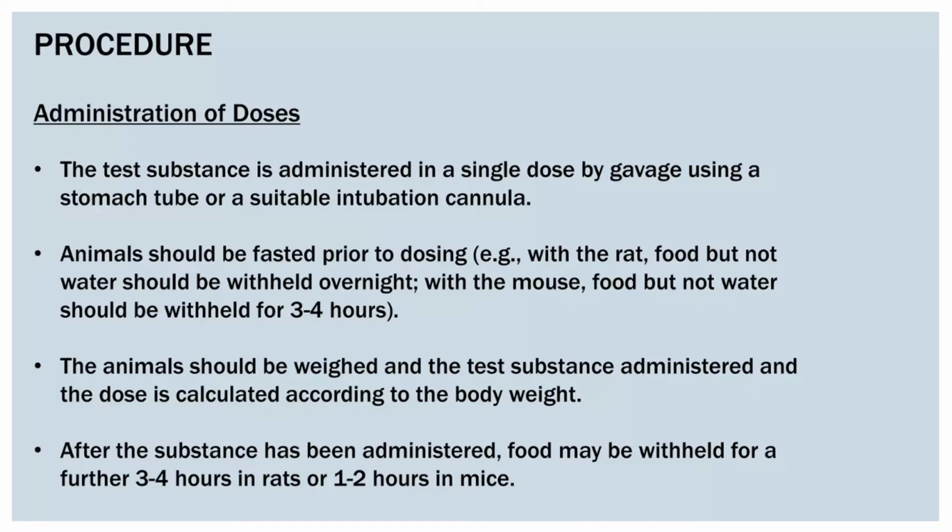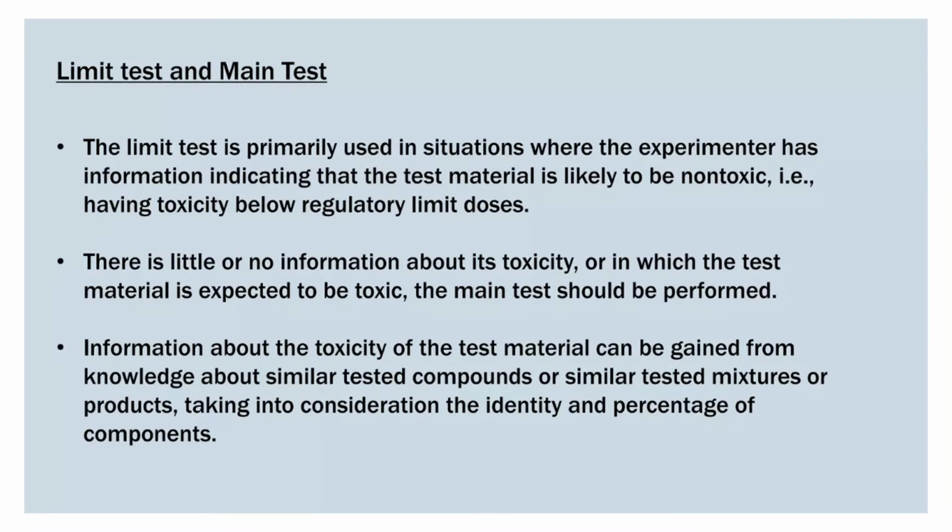The animal should be weighed, the test substance administered, and the dose calculated according to the body weight. After the substance has been administered, food may be withheld for 3 to 4 hours in rats and 1 to 2 hours in mice. Limit test and main test.